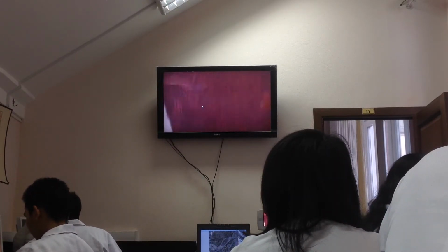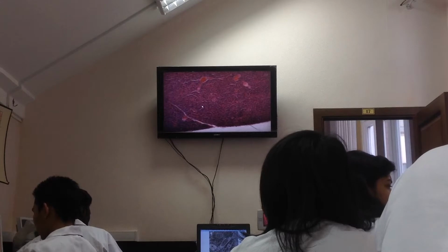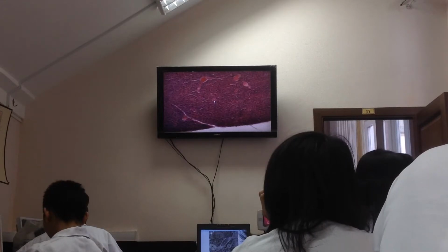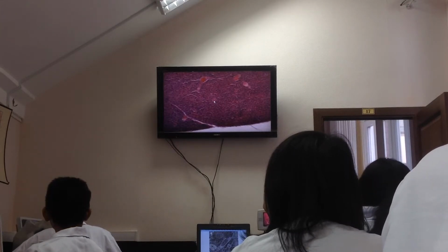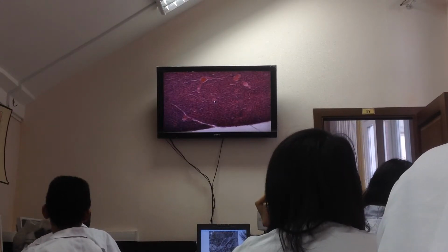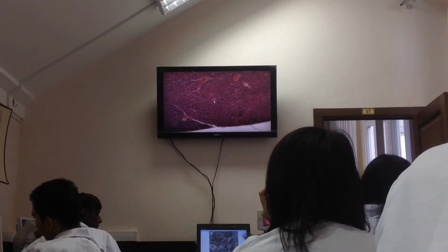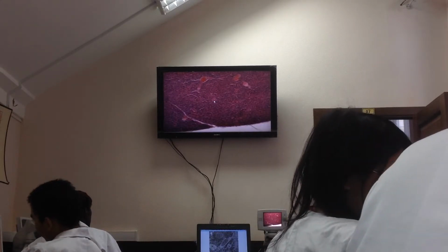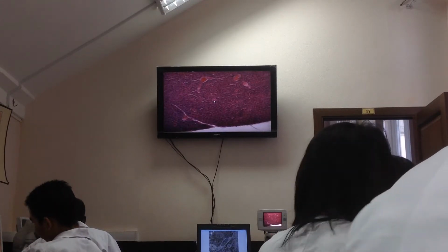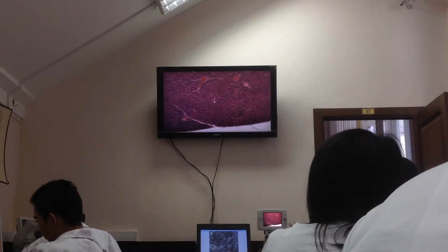Well, and now we must find, look. And this structure, it's a duct too. But where is this duct localized? In the lobule or outside of the lobule? Inside. So what duct do you see? Intralobular. Interacinar, situated between acini, but intralobular. Clear? Good.